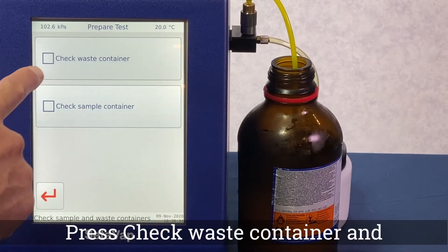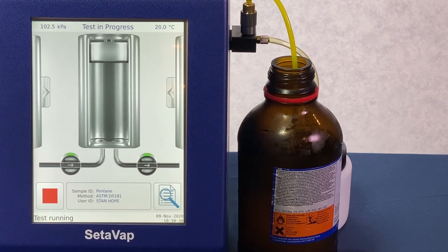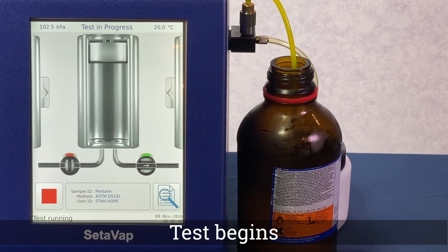As prompted on the screen, check the waste container and check the sample container. Then the test automatically begins.